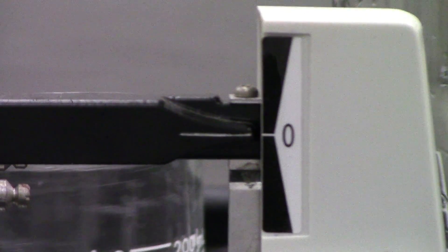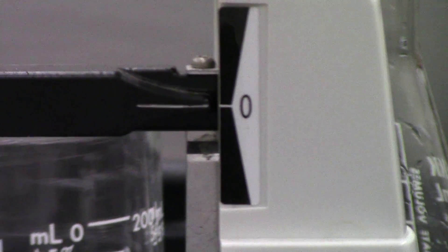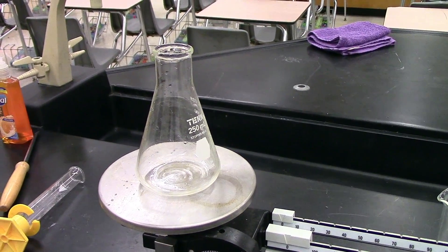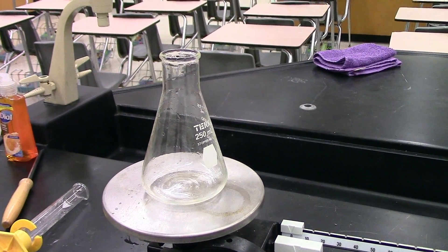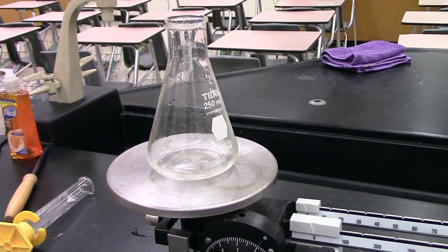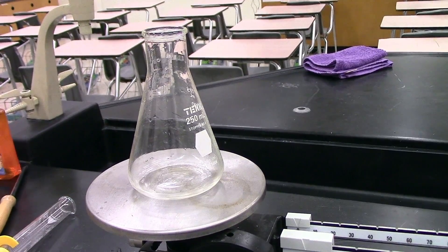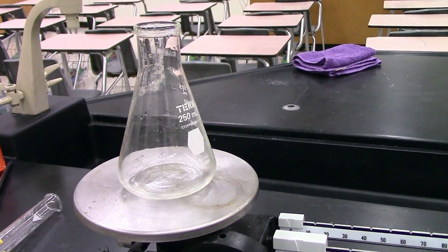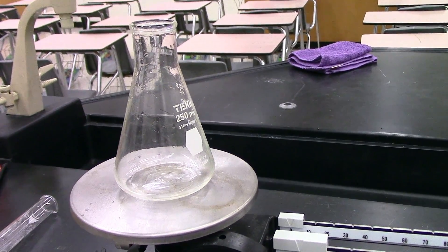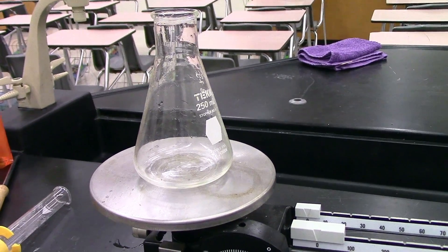Now we're ready to measure the reactants that we're going to put into this chemical reaction. I'm going to be doing this reaction in an Erlenmeyer flask, so the first thing I need to know is what is the mass of my Erlenmeyer flask. You can see there is a little bit of water still inside the flask because I've just washed it. That's okay because water is part of our reaction, and as long as we leave it there, it's not going to cause any problems in our results.